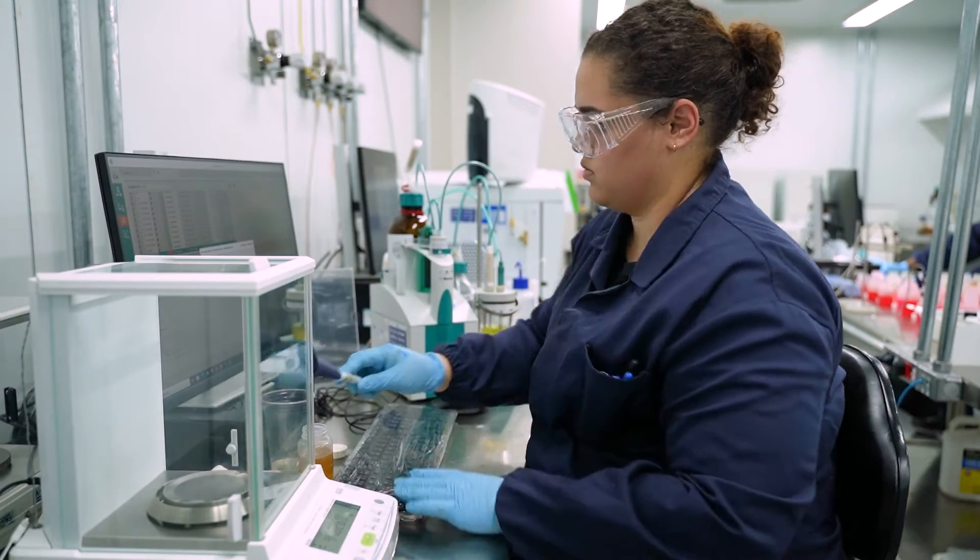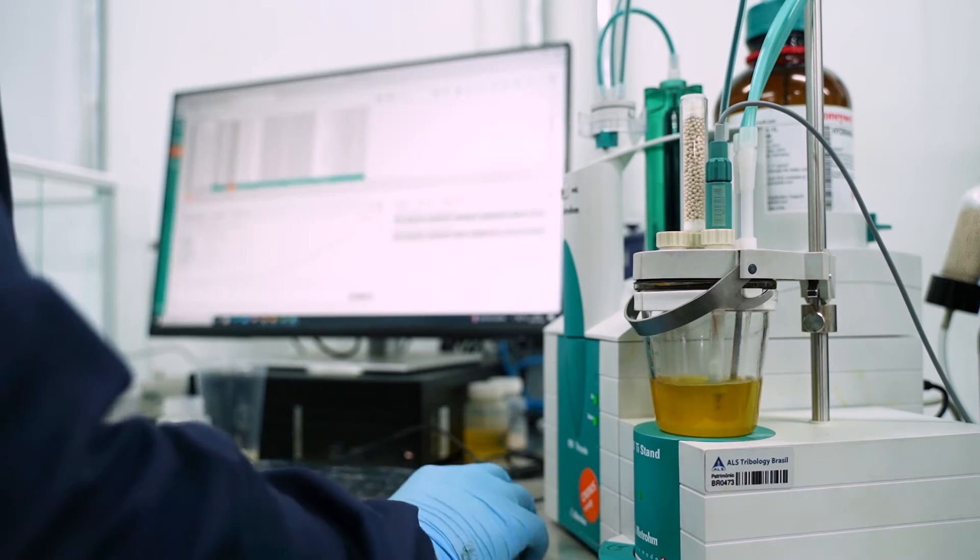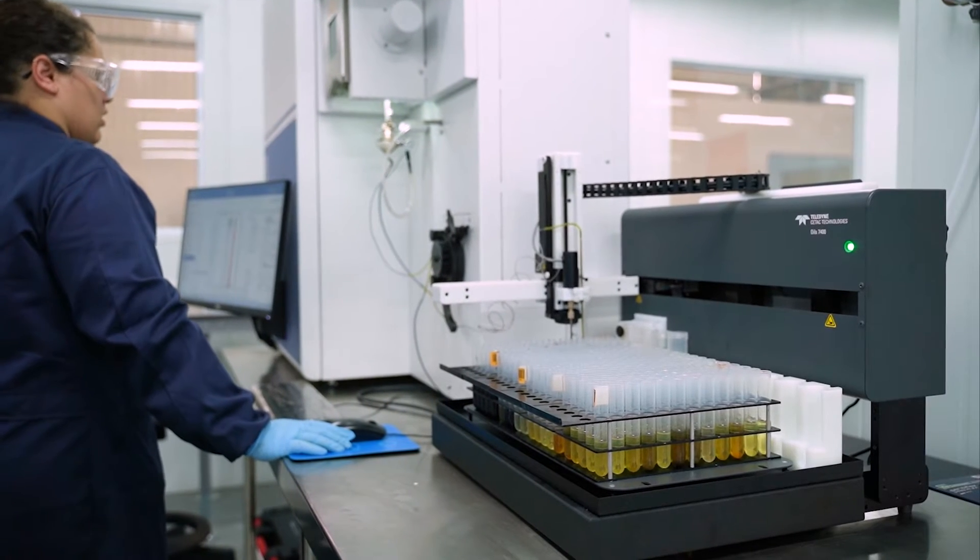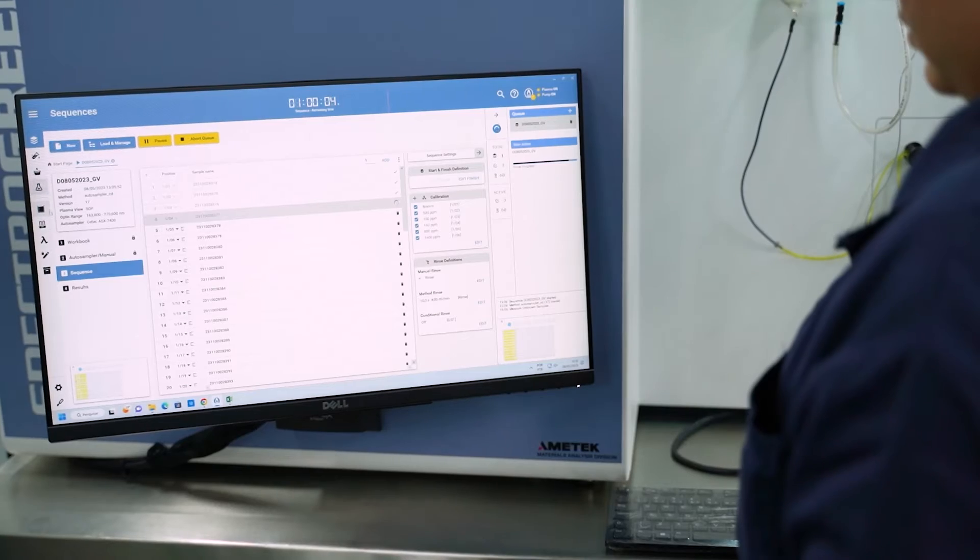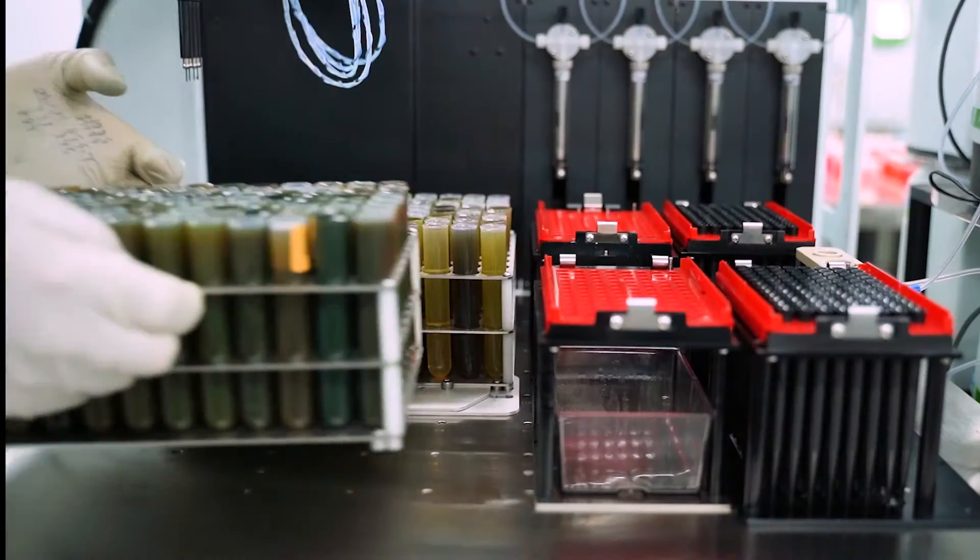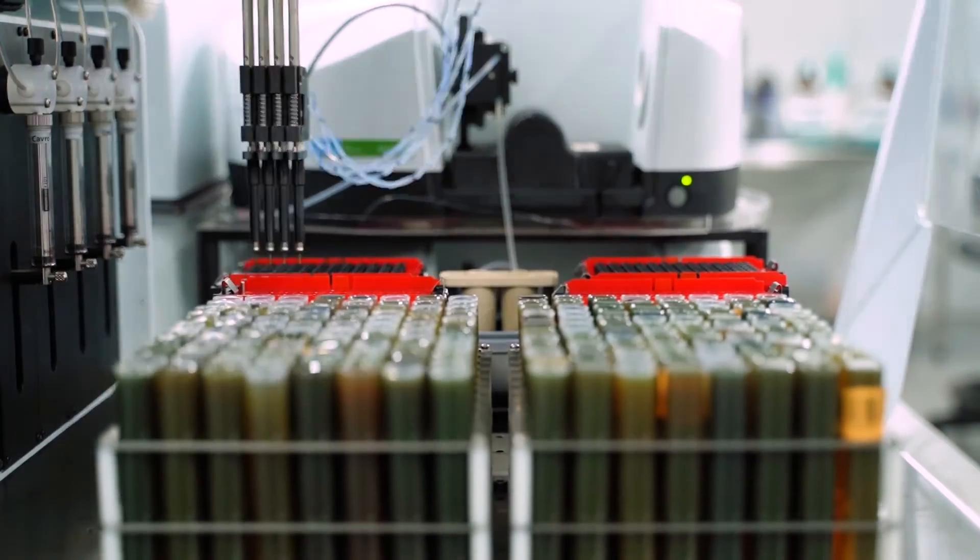The sample entry department begins the process of logging the samples into the laboratory information management system. Customer information, asset information, as well as oil information is necessary to track the sample and provide accurate diagnostic data. Time on the component and time on the oil is essential information to include with the sample.